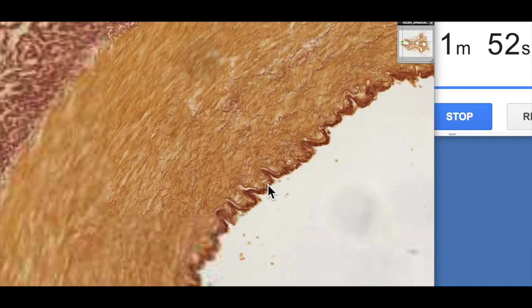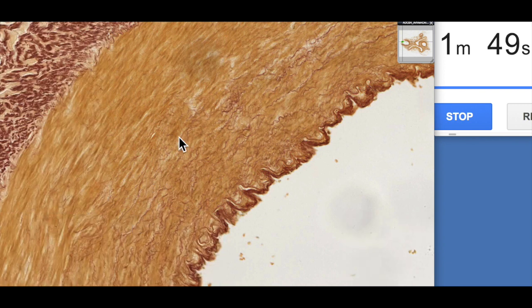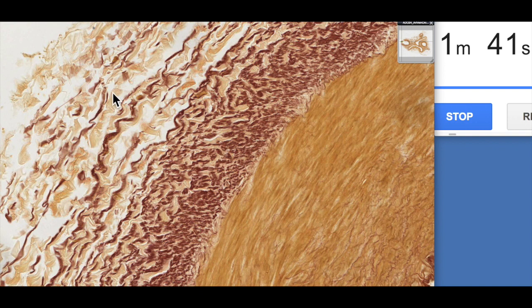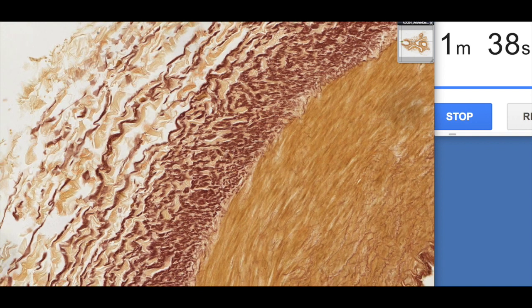Now here, we can see little squiggles of some elastic fibers in the tunica media. This is the tunica media here, but mostly the wall is made up of smooth muscle. And then out here, we've got the tunica adventitia made up of connective tissue here, dense irregular connective tissue.